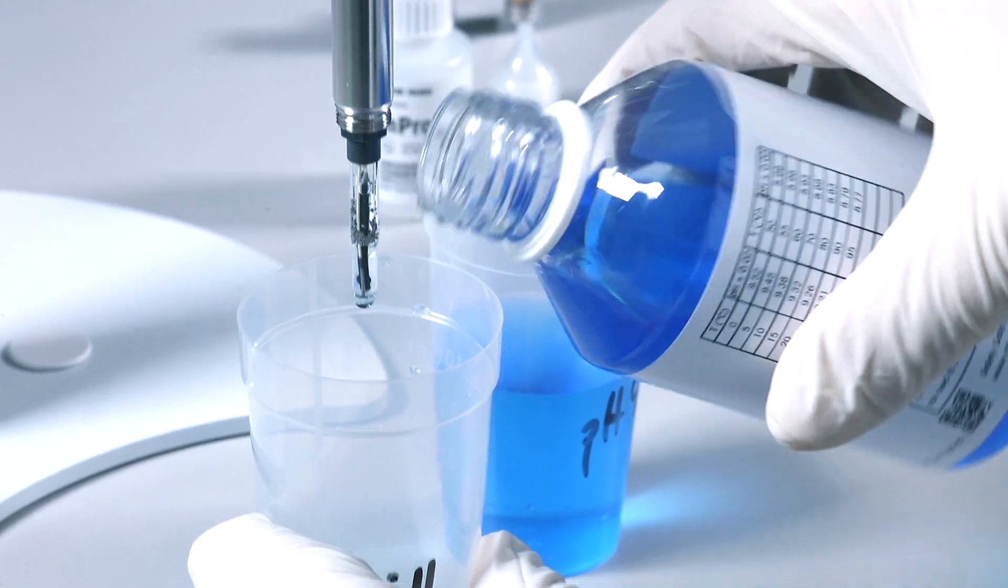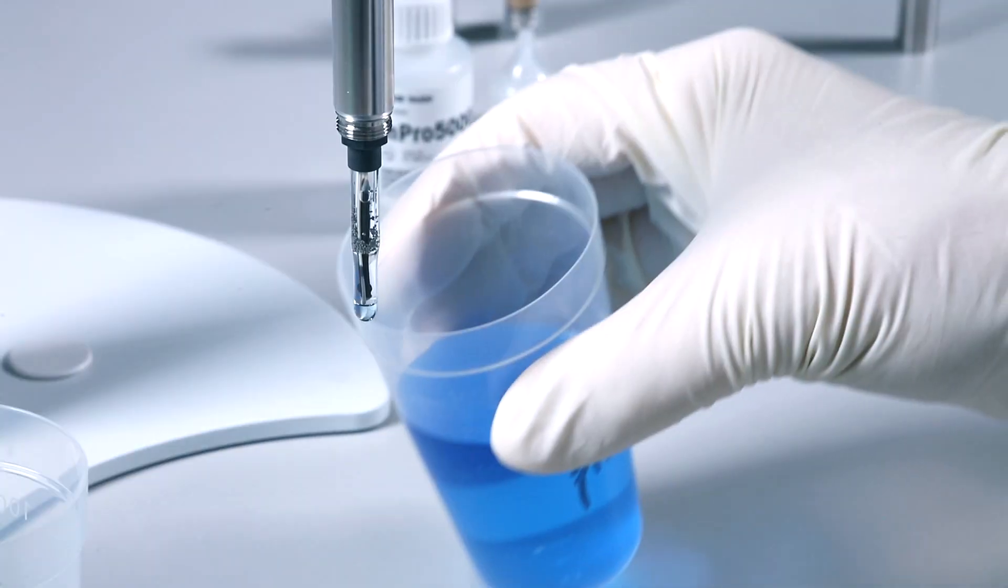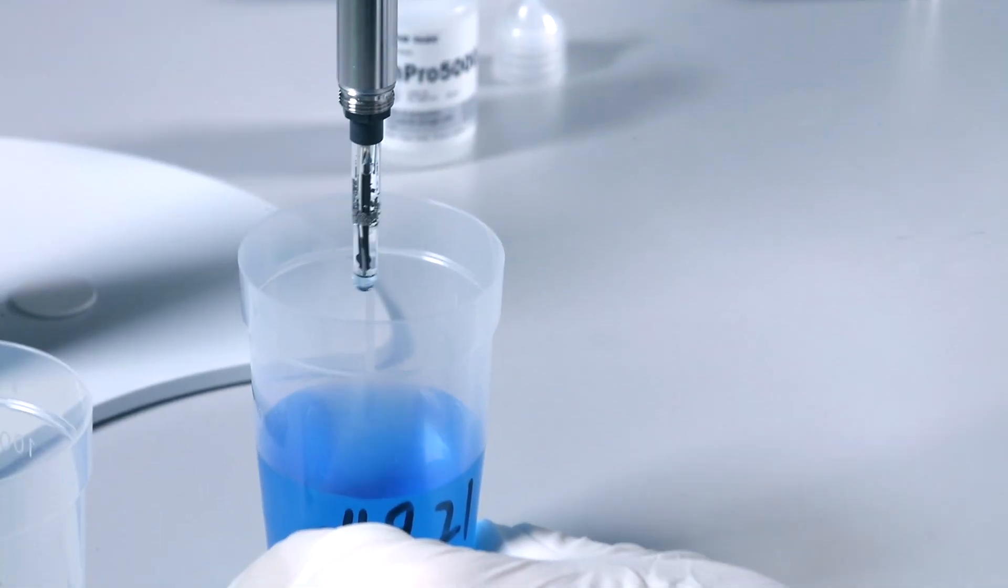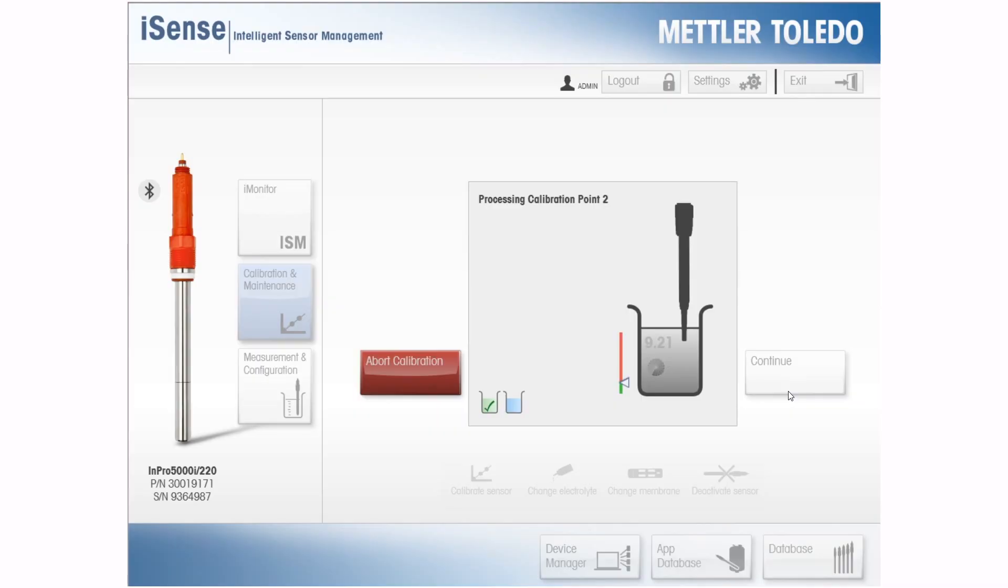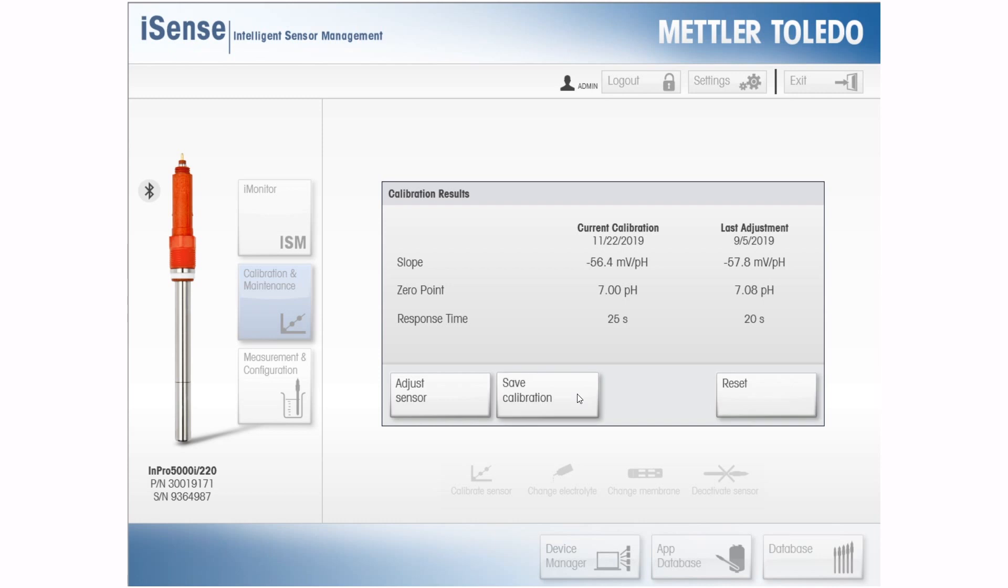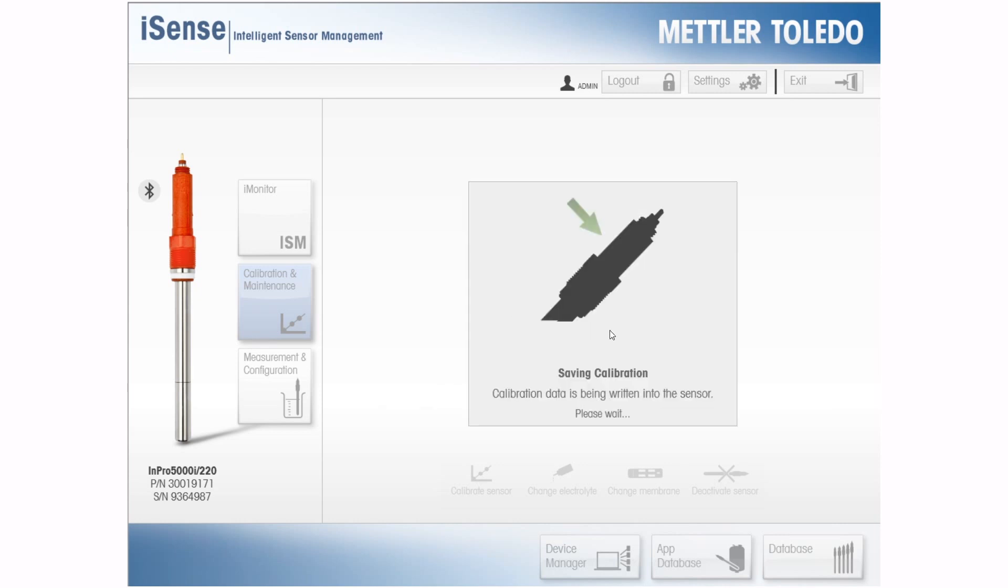Unlike standard pH sensors, adjusting the pH probe in the NPRO 5000i is not necessary at this stage. The purpose of this calibration is to check the sensor's slope. If the slope is above 90%, the sensor can be confidently used again. If the slope has fallen below 90%, the pH probe must be replaced. Press save calibration to record the data to iSense. The data can be used to conveniently monitor sensor slope from batch to batch.